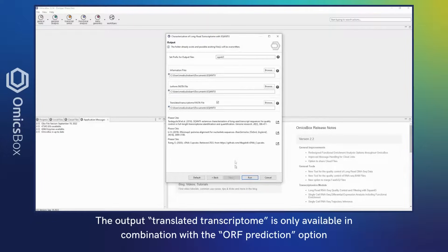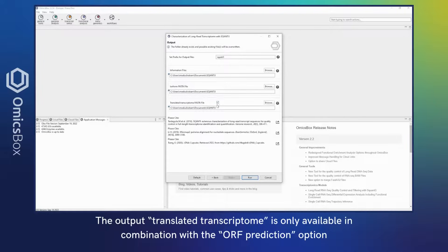The output, translated transcriptome, is only available in combination with the ORF prediction option.